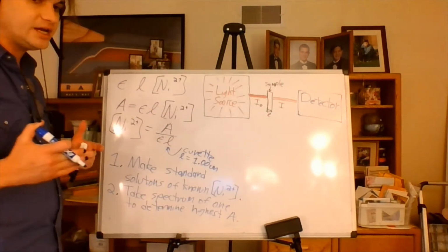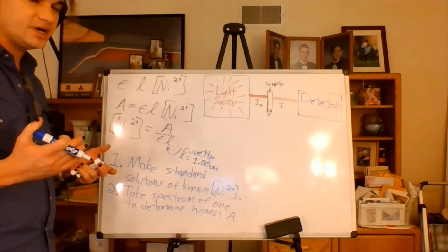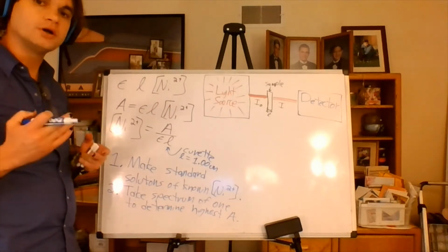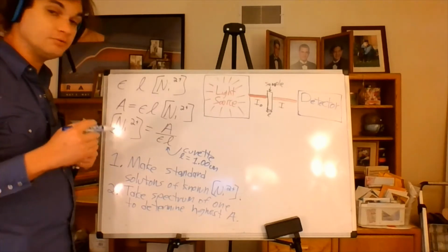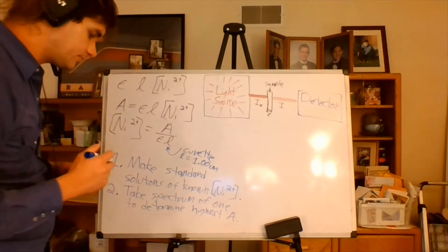Hypothetically, we could pick any absorbance in the spectrum, but usually you want the strongest absorbance because that will give you the most accurate data.